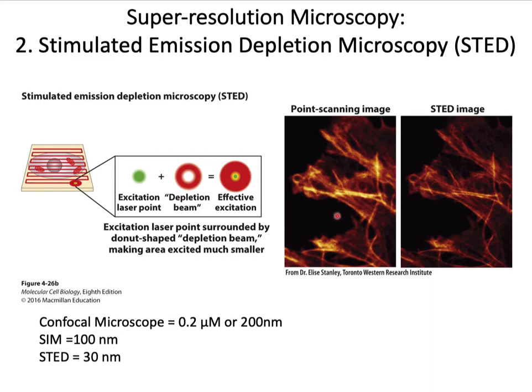So you can see the comparison on the right of a point scanning confocal image with a STED image, which can push the resolution to 30 nanometer range.